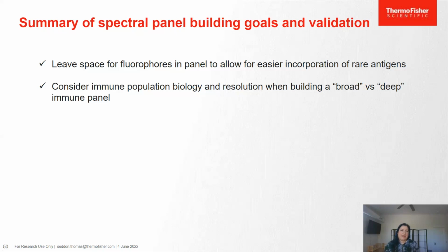So to step back about what that means, for instance, if you're building something and you have an incredibly rare population and need a certain amount of brightness, you really might need to take out a certain number of fluors to get as good of a detection as you want, because you will start to lose some of your resolution as you build to more colors. So that's important to really think about. Also thinking about matching that brightness if it's really a dim population.